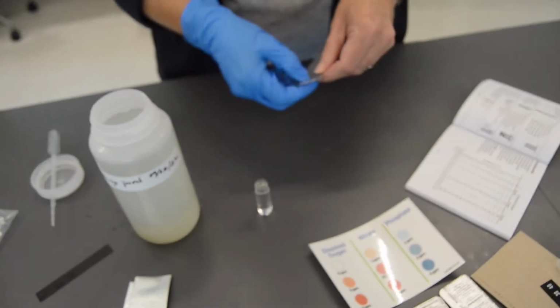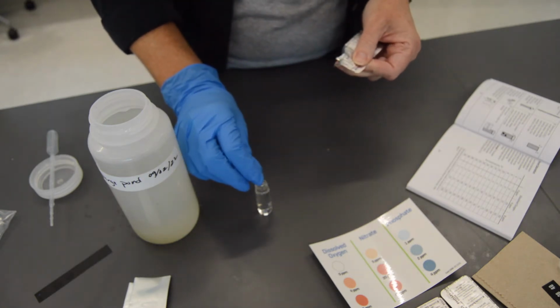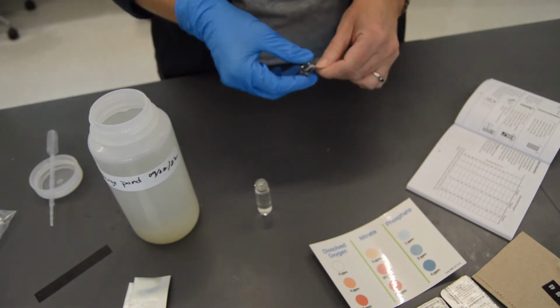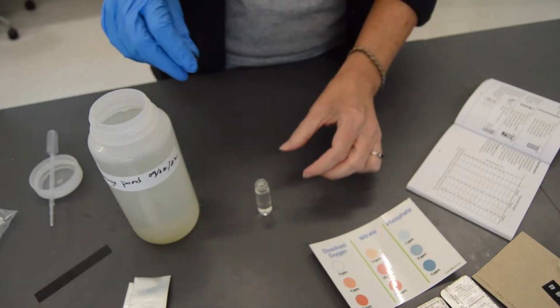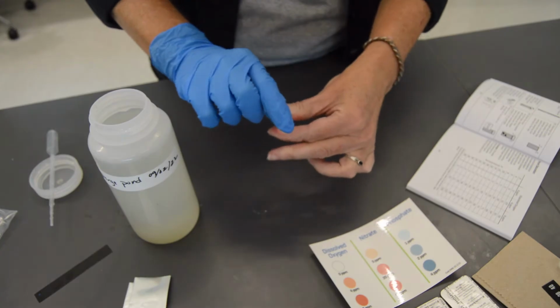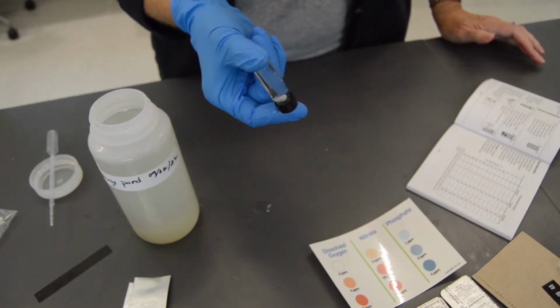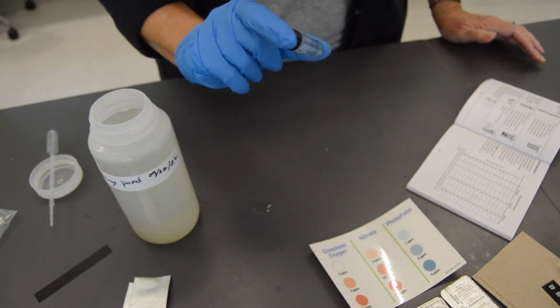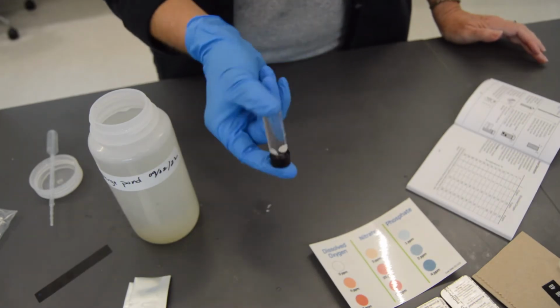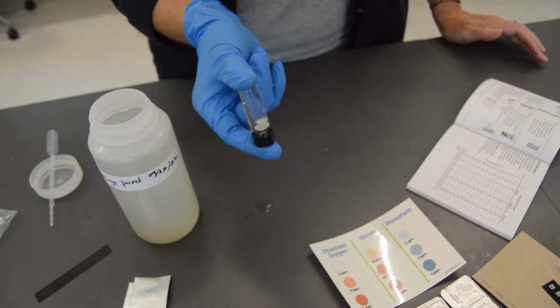So then we're going to take our dissolved oxygen tablet, and we actually put in 2 of these. One. Two. And then we're going to cap it off. Again, you're going to have some overflow, but that's a good thing. And then we want to dissolve it. It takes about 4 minutes for the tablets to fully dissolve. And then we have to wait for another 5 minutes for the color to develop. So hopefully we'll get some time lapse from there.